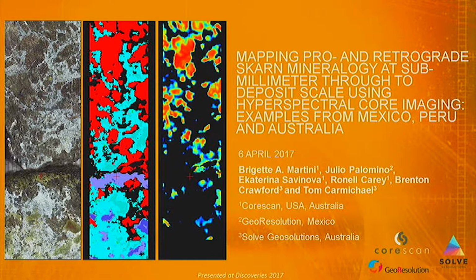We all know that there's an extreme amount of mineralogy in skarns, a lot of different mineral species. However, ultimately, there are also some very simple relationships in skarns as well. And so what I'm going to be showing you today is going from the simple, but straightforward part of skarn identification and logging, i.e. just the basic identification of minerals. And then I'm going to take you down into the weeds and show you some of the more complex things that can be brought out of skarn using hyperspectral.